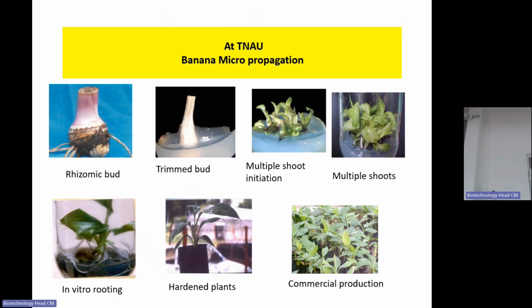But this will also produce the leaf, which will be the petiole, which goes up, and this will give the actual leaf. Right? So when you remove all this, cut all of this, shave all of this, and get only this part, you take this part alone, the shoot tip, and there are no other shoots because this controls all other side branches, right? So how many shoots will you get from this? You put it together.